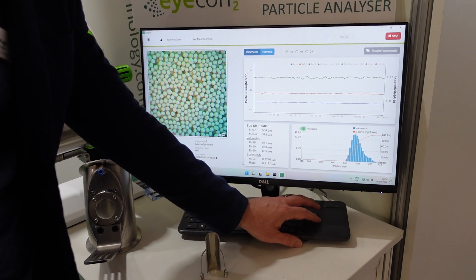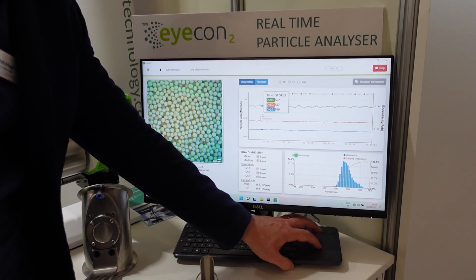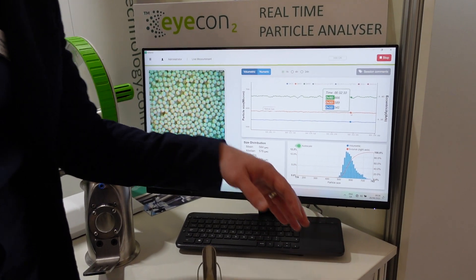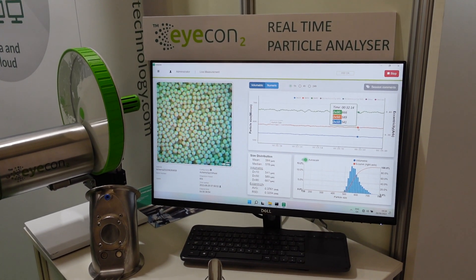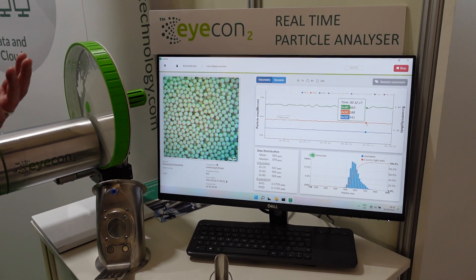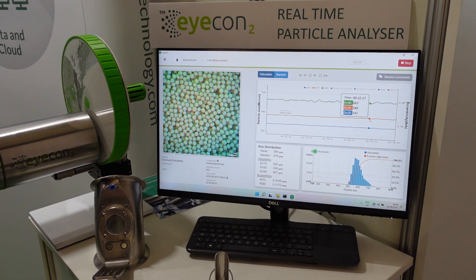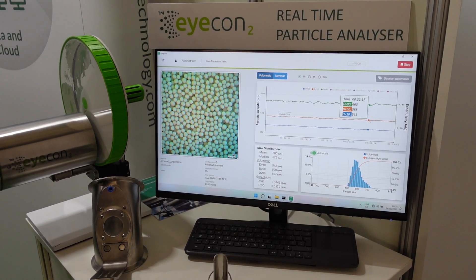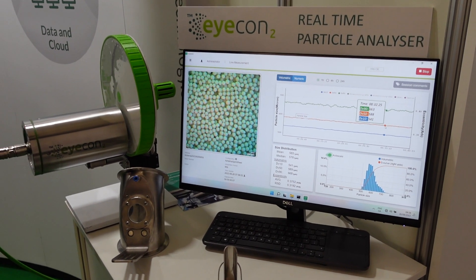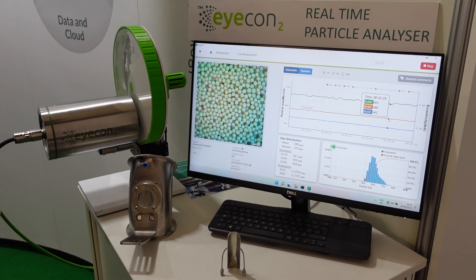The software is interactive, so if I hover over these charts you can see the D10, D50, and D90 particle size results. This can be really useful in a process environment where you want to monitor quality control, get an end-product profile of a certain particle size, or modify your process to improve yield, efficiency, or speed. This is really where measuring particle size in-line in real-time has its advantages.